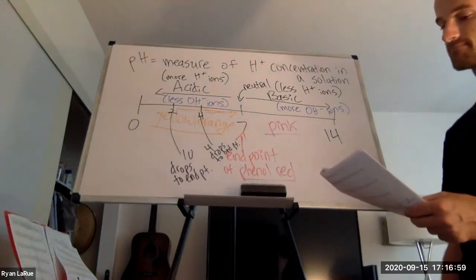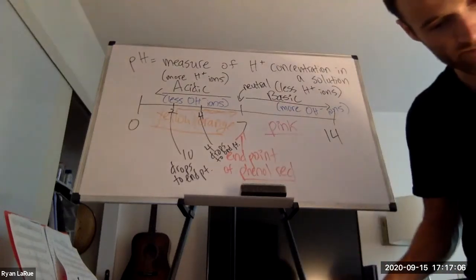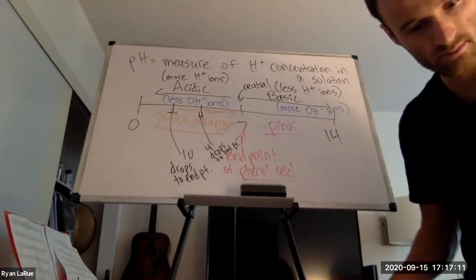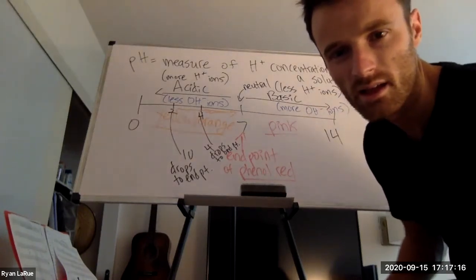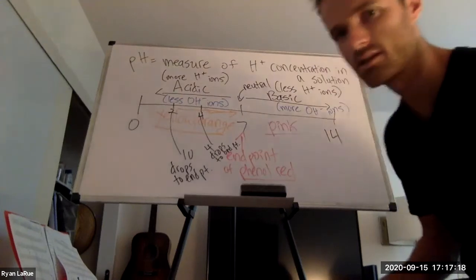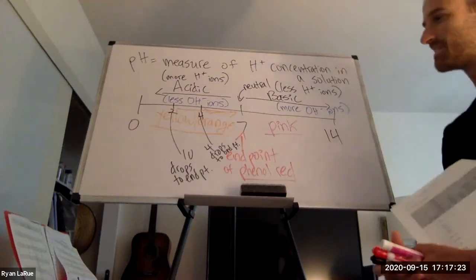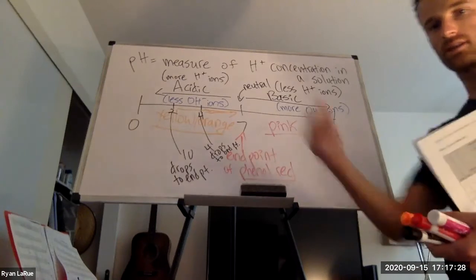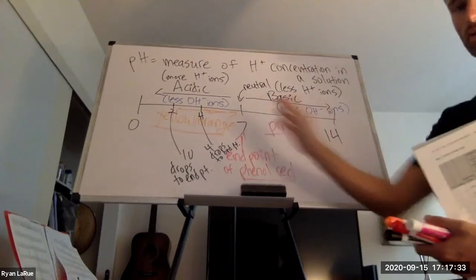I think that's it. Let me see, I had a question here. I think she counts the drops. I think so. I don't think she'd make you do that. But if we were in person, you would count your drops of acid or drops of base, depending on what you're titrating.